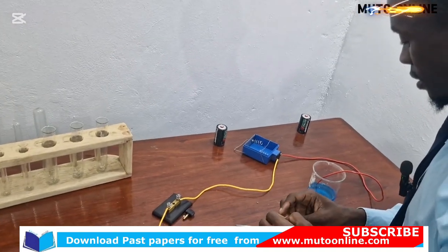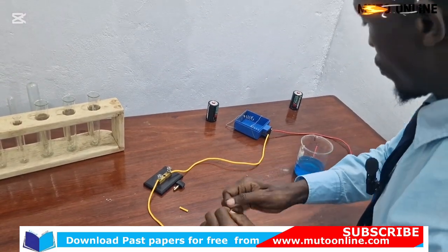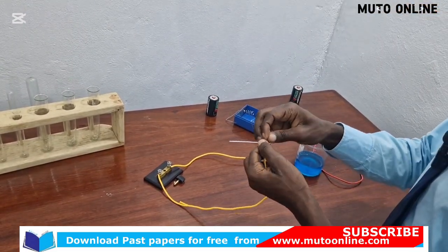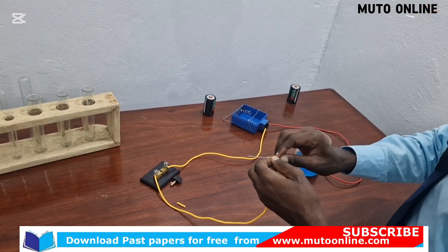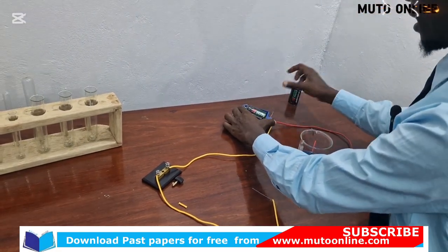Then, before this, I'm going to put my pin I want to coat with copper, my dry cells into the holder.